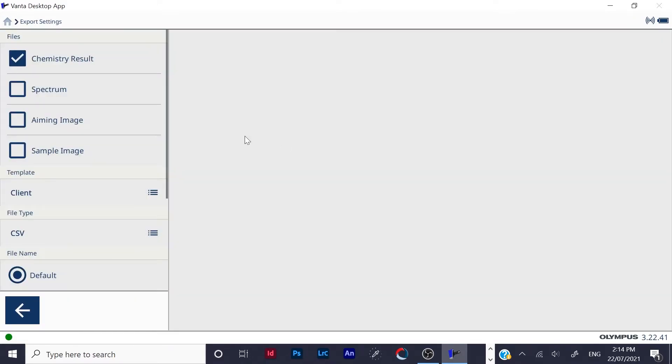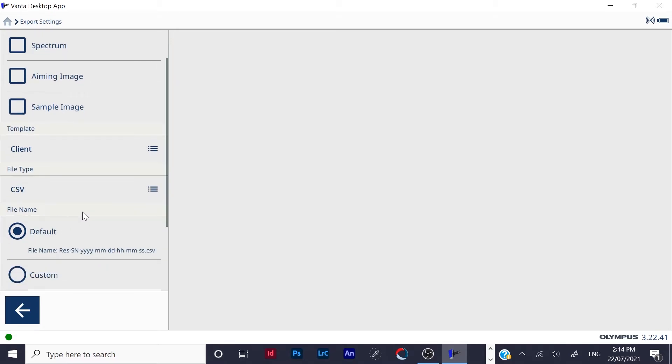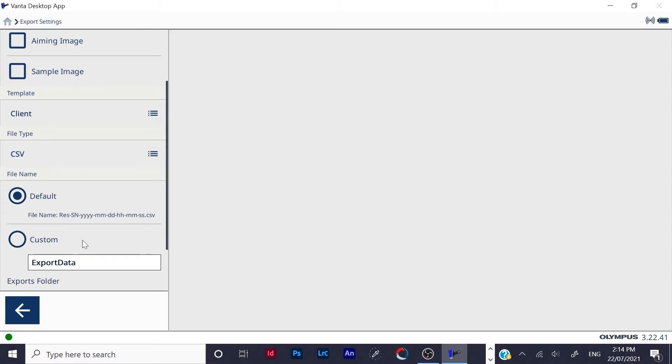And you want to make sure chemistry results has been ticked. The template is for client, file type CSV, file name default.